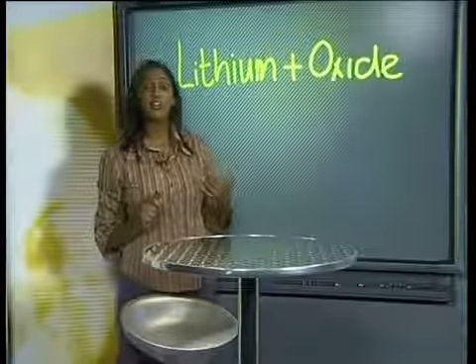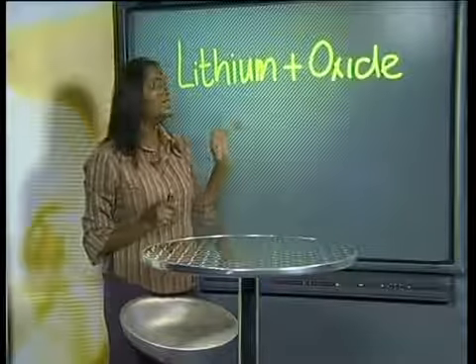So, the product formed during this reaction is lithium oxide. We will retain the lithium oxide for further tests in later lessons. Now let's take a look as the same experiment is done with sodium and potassium.